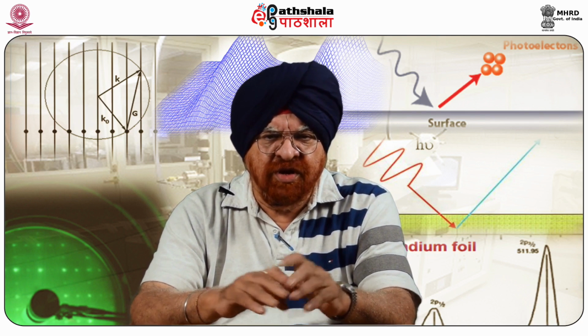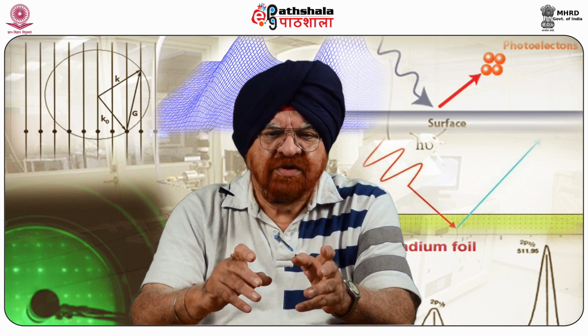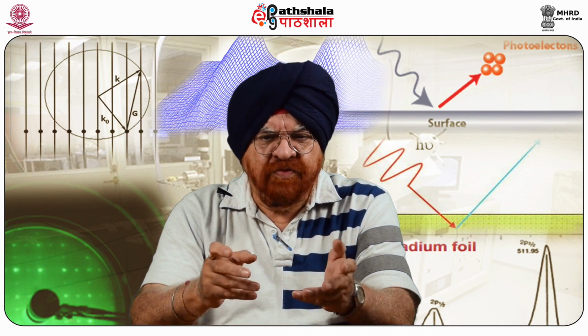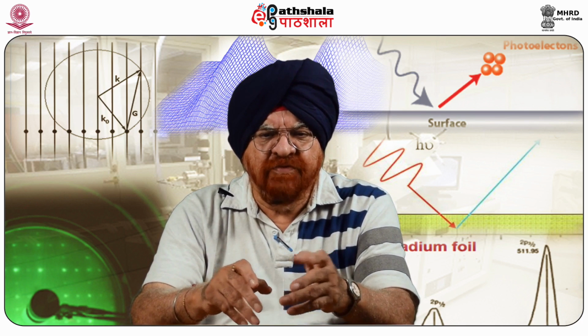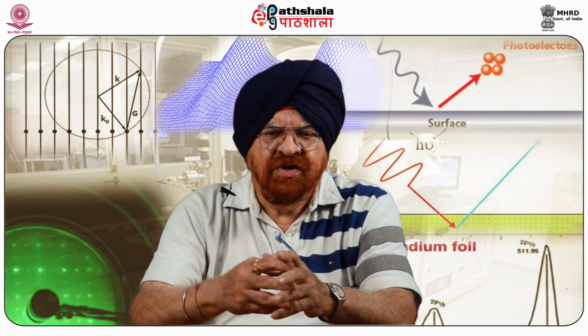XPS is routinely used to analyze inorganic compounds, metal alloys, semiconductors, polymers, elements, catalysts, glasses, ceramics, paints, papers, inks, woods, plants or plant parts, makeups, teeth, bones, medical implants, biomaterials, various oils, glues, oil modified materials, and many others.